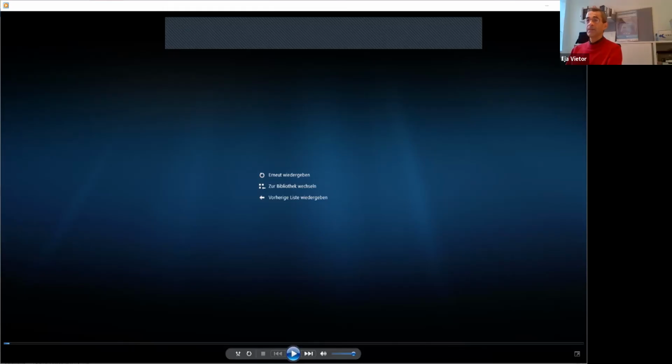So this is all that I wanted to show you. You have seen now within 1 hour the procedure which would take you 2 days. I hope that you have understood what is done and how it is done, and you will be able to do a similar experiment on your own. So what I expect from you now is that you will have a look at the raw data which I have prepared for you, and they are shown here.